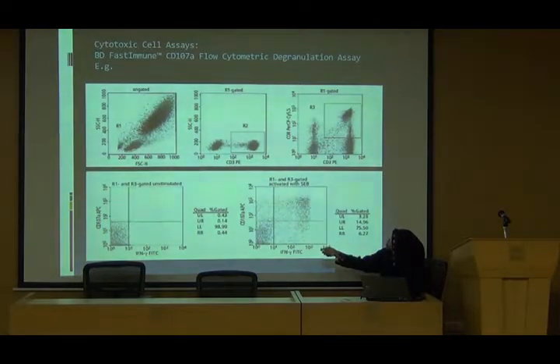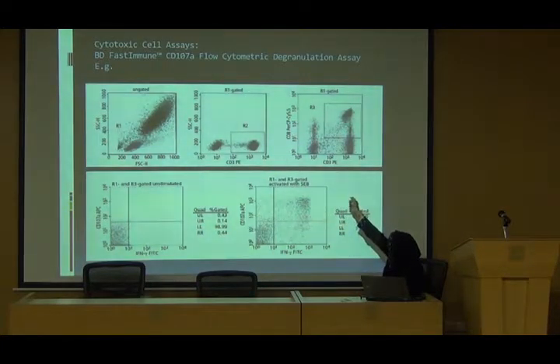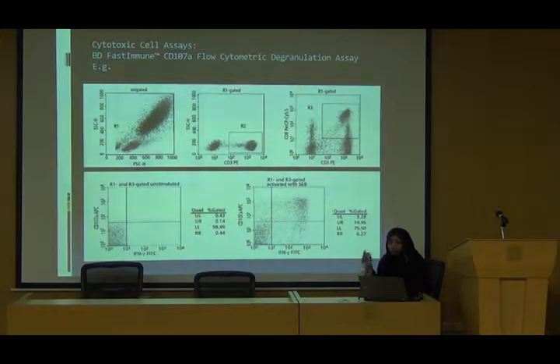So here is the gating strategy. Say you have the lymphocyte, you label it with CD3, and then you label it with CD8, you gate them. And from that, you will analyze for interferon gamma and the CD107A. And here are the cells and the numbers of the activated cells. And you can know which one of the cells does produce interferon gamma, you can change interferon gamma to another marker, you can even change 2 to 3, 4 different cells and analyze them all together, then you have exactly when you activate the cells, what cell is activated and what does it produce.